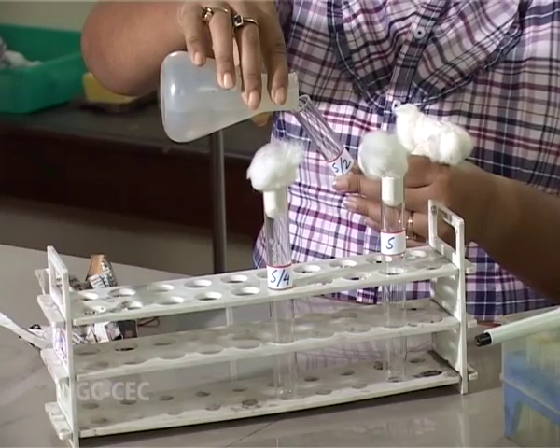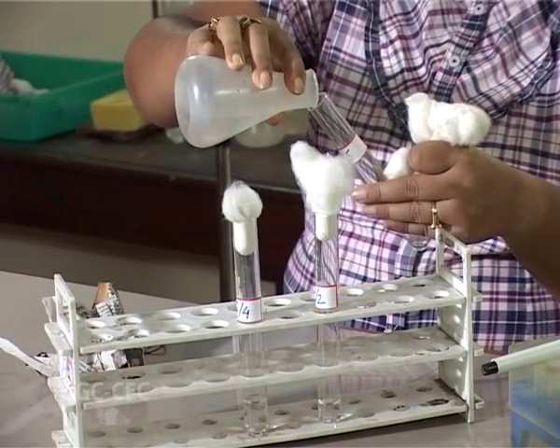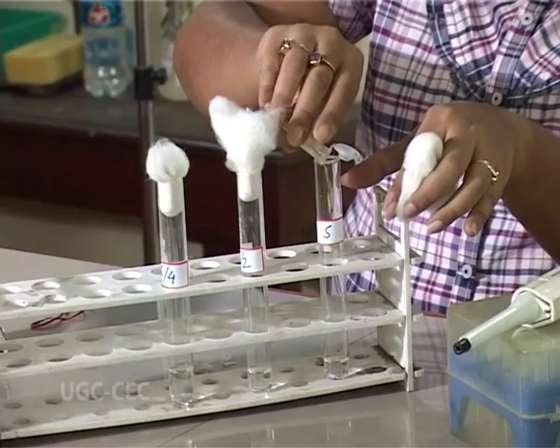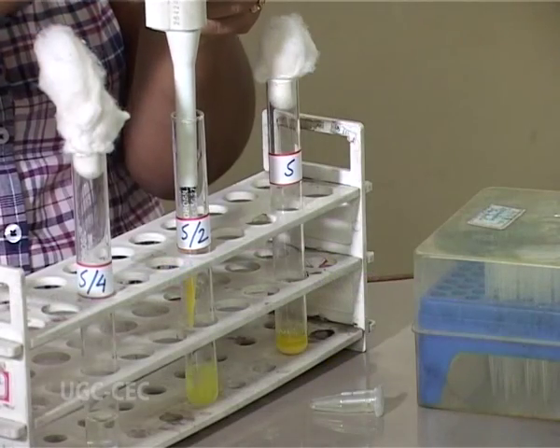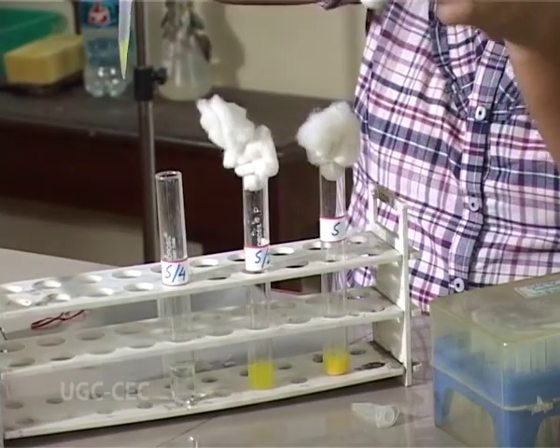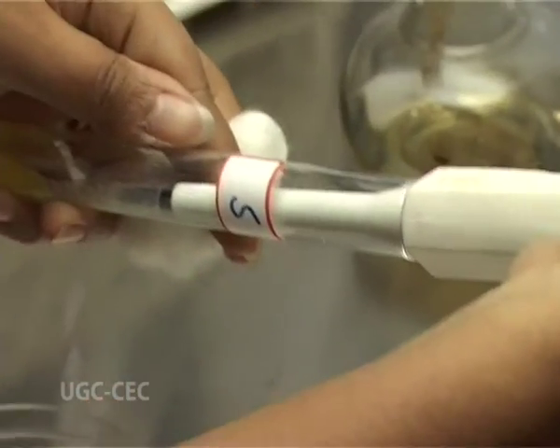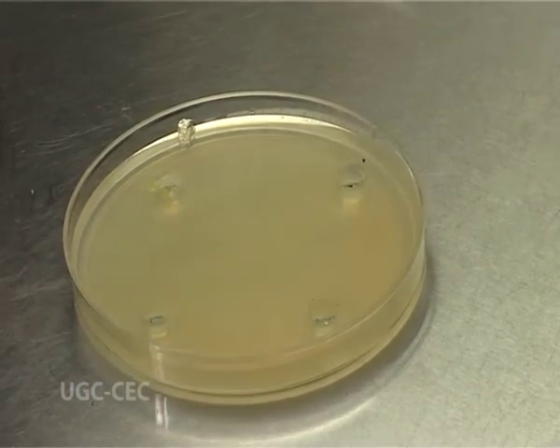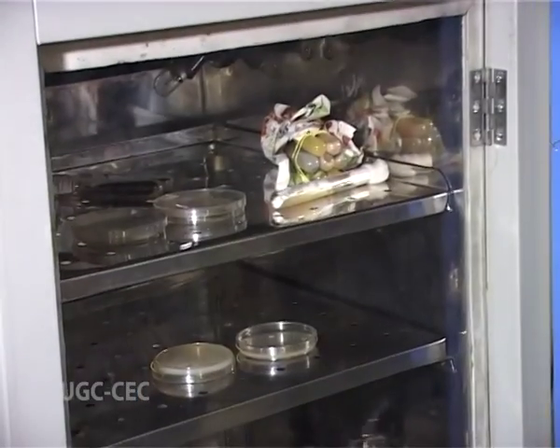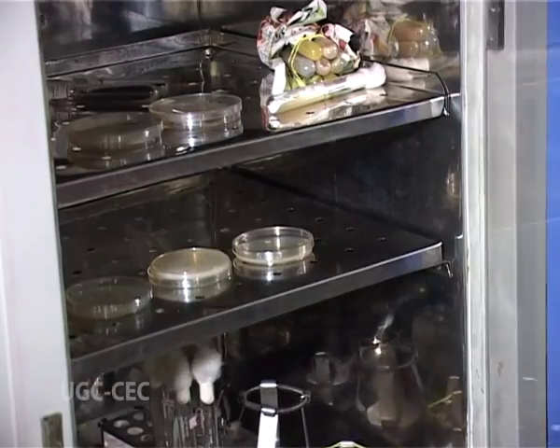Next, a master stock of antibiotic S will be prepared with sterile distilled water in a culture tube. Then from that, S, S by 2, S by 4, different concentrations of the antibiotic will again be made with the help of sterile water in different culture tubes. And after that, with a 1 ml pipette, 0.2 ml of antibiotic will be dispensed inside different wells. And they will be kept in the incubator in an upright manner for overnight observation. Now, the diameter of the cork borer is 2.5 millimeter.